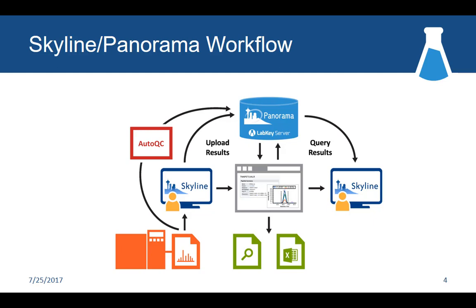So that's one thing that's been great about the collaboration: being able to really have these things connected, as opposed to, oh, well, you can get that to talk to the other thing, but you have to do this other scripts and all this other nonsense. Trying to make it as correct as we can to make it easier and set up that feedback loop. So then once it's in Panorama, you can look at it through a web browser.